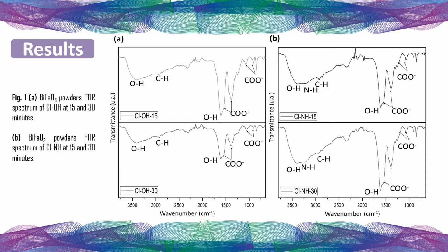The bands in the range of 1353 to 1715 correspond to a vibration of a symmetrical stretch.